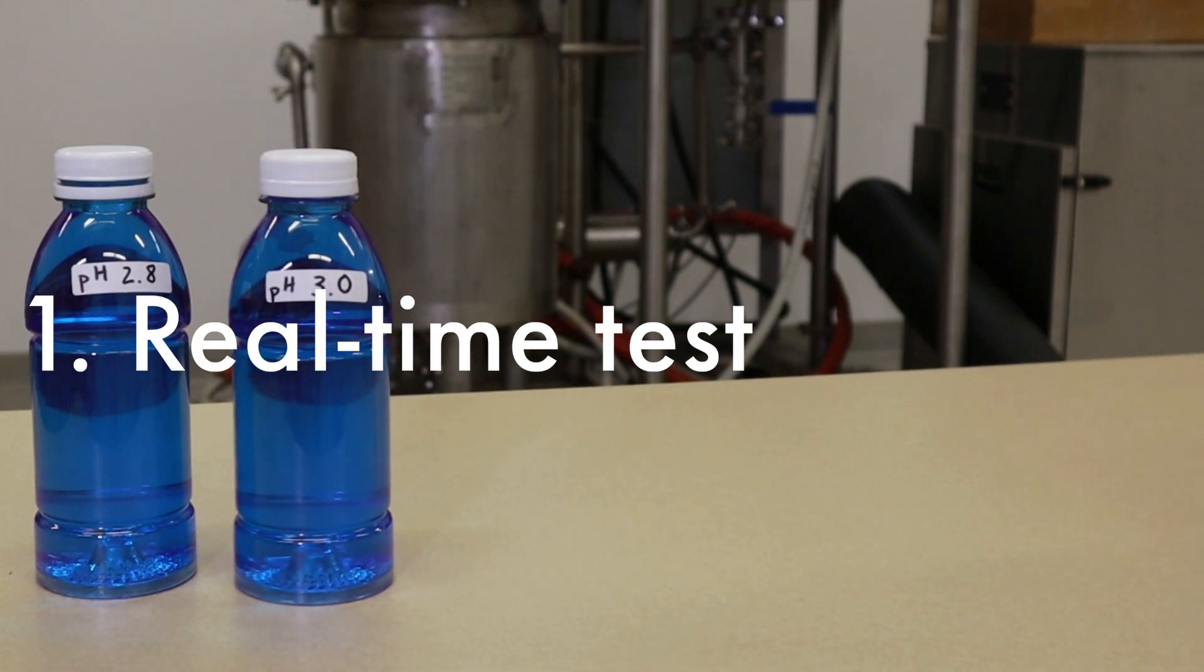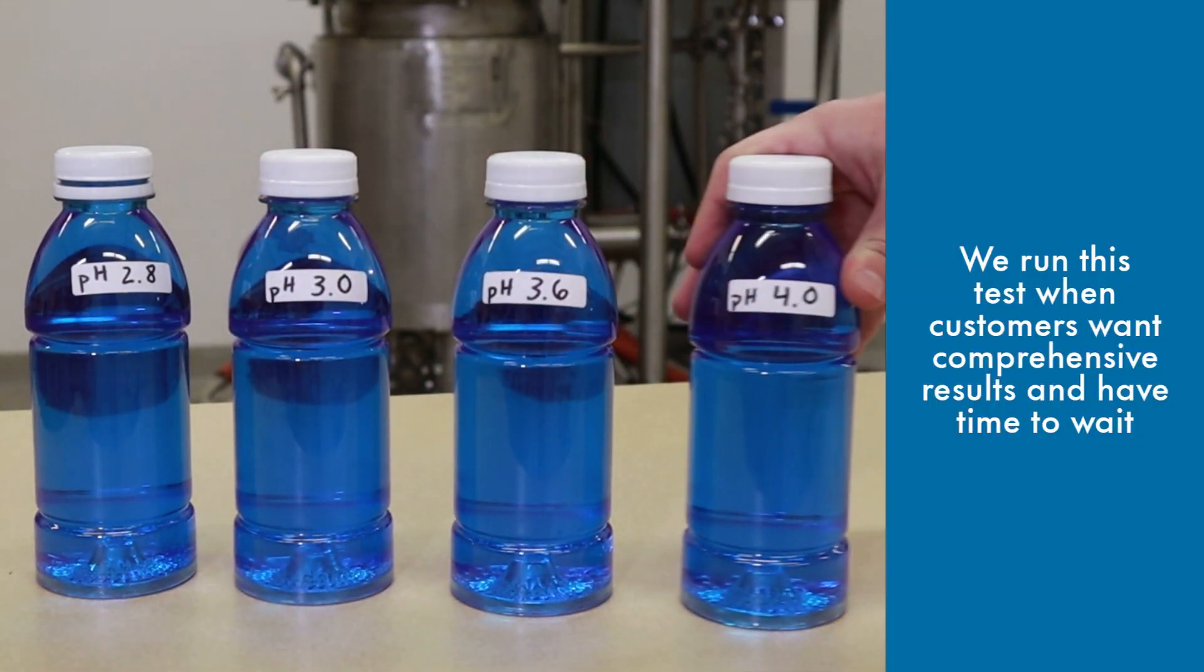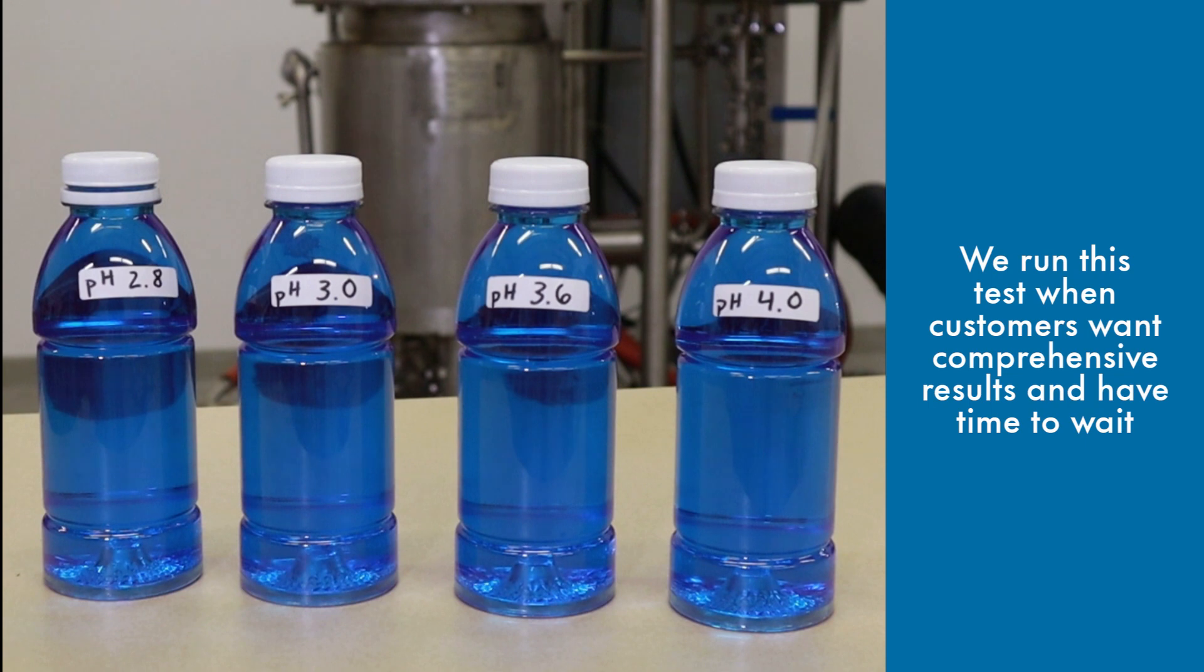In the real-time test, we store the samples at room temperature for 9 to 12 months, remeasuring the color every month to see if there has been any change in color.